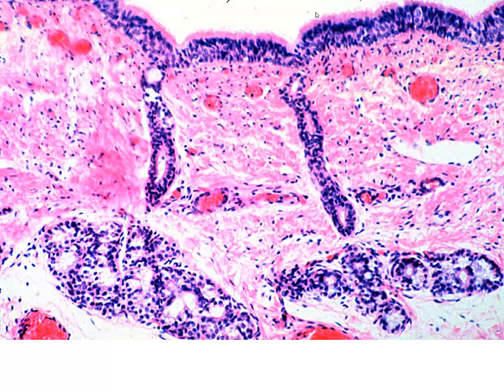Once again, we're looking at the epithelial lining at the top. We can see the seromucous glands in the trachea, the ducts radiating through the submucosa.